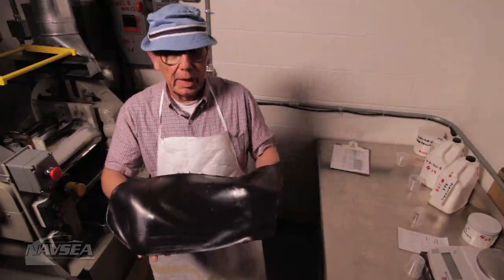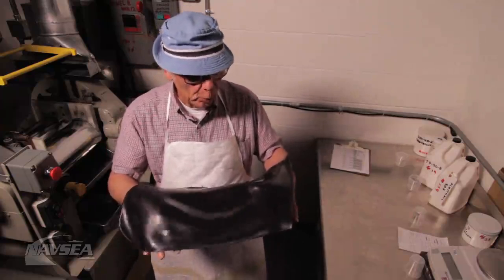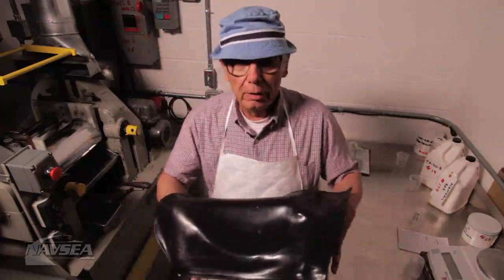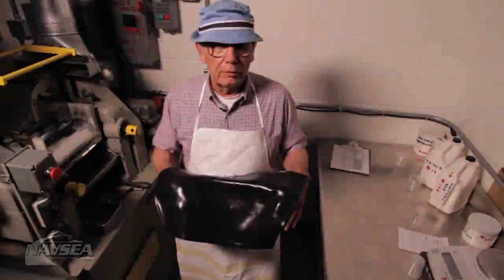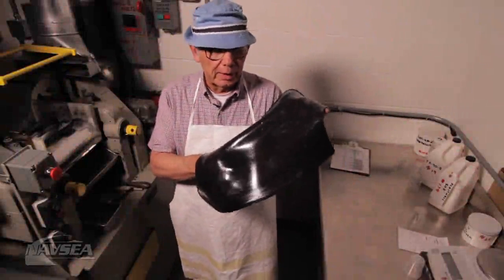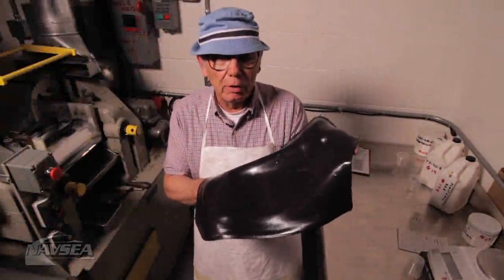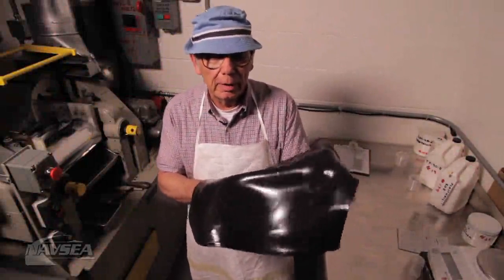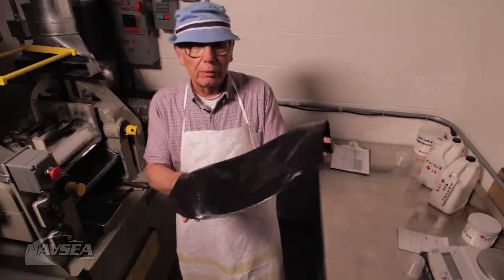If I were to add more plasticizer — recall the liquid material — would it make this batch harder or softer? If you recall that the addition of more plasticizer would make this batch softer, you would be correct. Now we're going to send this batch over to Elizabeth for further testing.